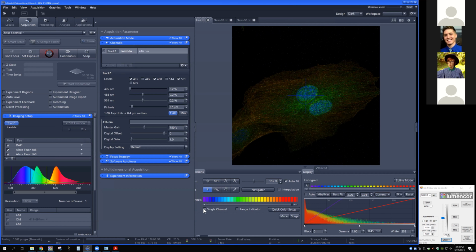All right, so if we turn off the single channel here down at the bottom, then you can actually see all of my different bins represented across the bottom. This is basically all 32. And you can see the midpoint of the wavelengths that they're working with. And the colors that are chosen here represent effectively what that emission would look like if we could actually see it by eye.